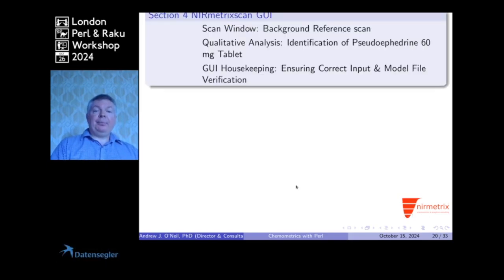Okay. So moving on to my GUI, I've set it up to make it a very simple looking GUI with 3 large buttons, something that could potentially be used on a touch screen, so that a user doesn't have to use a mouse in order to control the spectrometer. So there's 3 buttons: one to acquire a scan of a sample, but also the background reference scan of that PTFE standard that I mentioned. That has to be acquired. That's quite important to acquire that first.